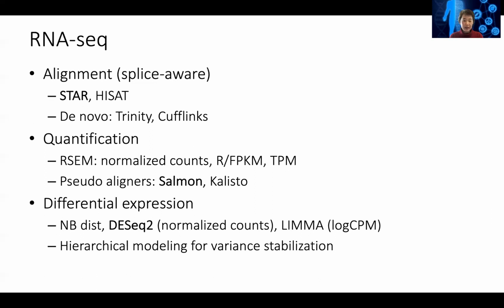After we get the quantification, we will want to compare the differential expression. And we discussed this, and in RNA-seq, the read alignment distribution across the genome actually follows a negative binomial distribution. And there are also different differential RNA-seq analysis algorithms. If you have a limited number of samples, DE-seq is currently considered the most accurate one. It calculates differential expression at the normalized read count level.